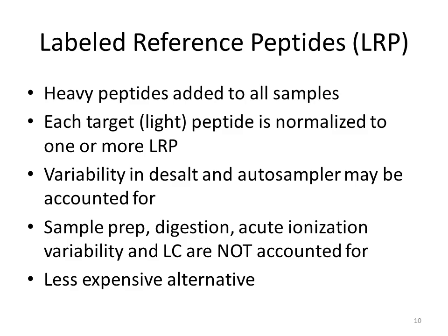So one version, if you don't have access to a different isotopically labeled peptide for every analyte, is something called the labeled reference peptide. Let's just say you have the Biognosis IRT peptides or the Pierce PRTC peptides. These are heavy peptides. They shouldn't interfere if you're analyzing human samples. I think they're yeast, maybe they're E. coli. Does anyone know? I don't know. They're a different organism. Anyway, they're heavy labeled, so they shouldn't really interfere with what you're doing.